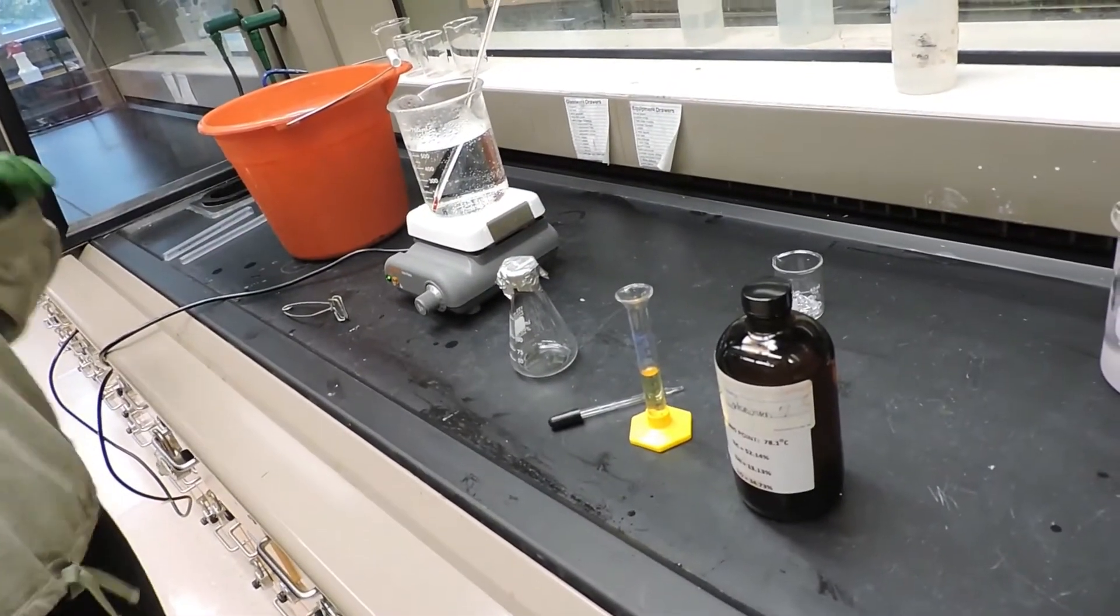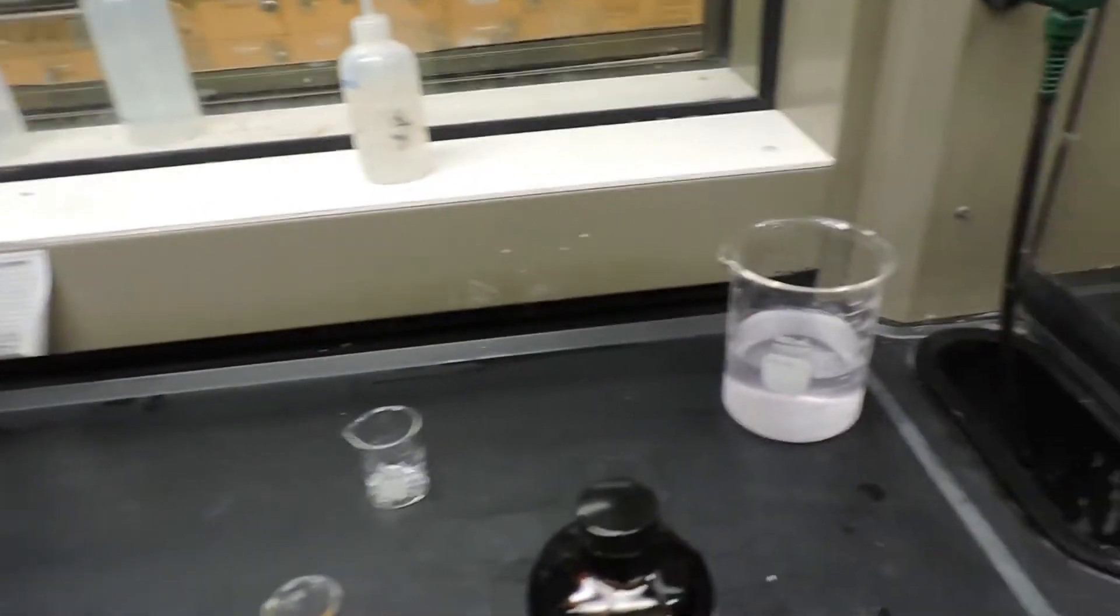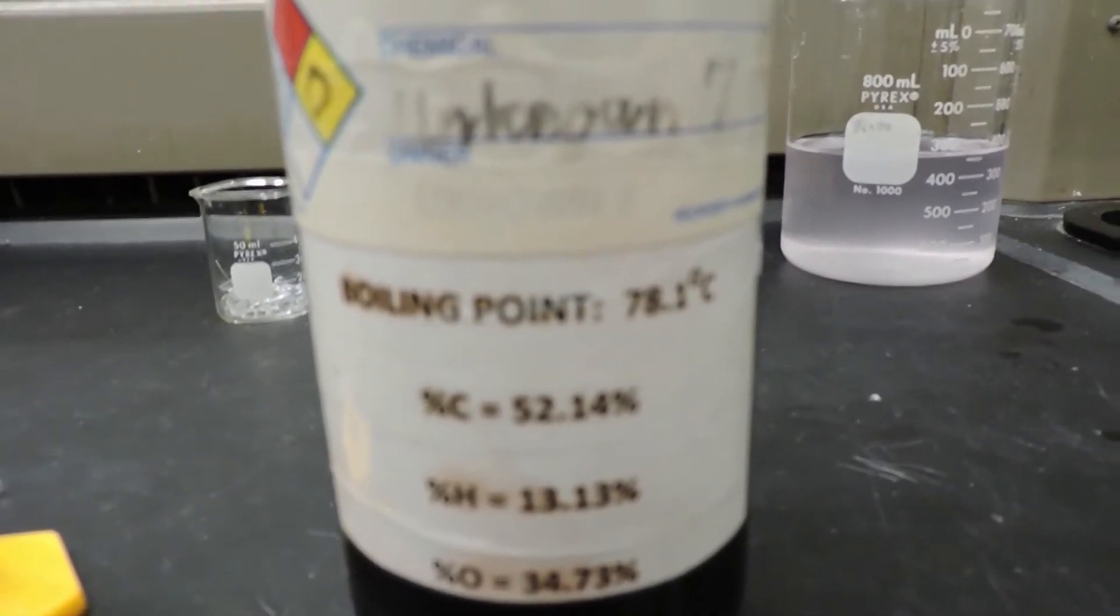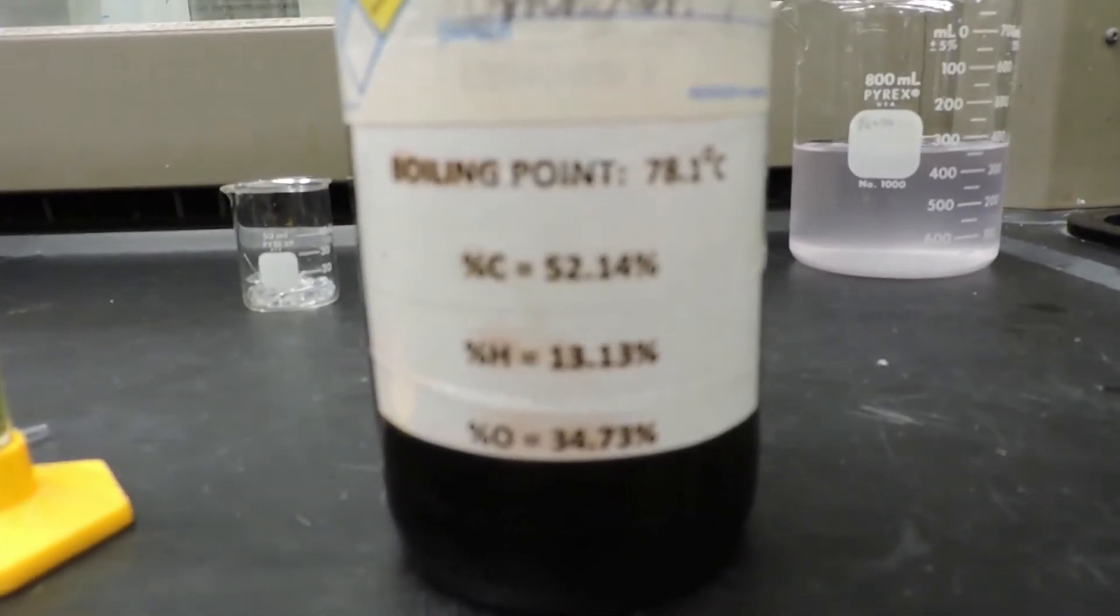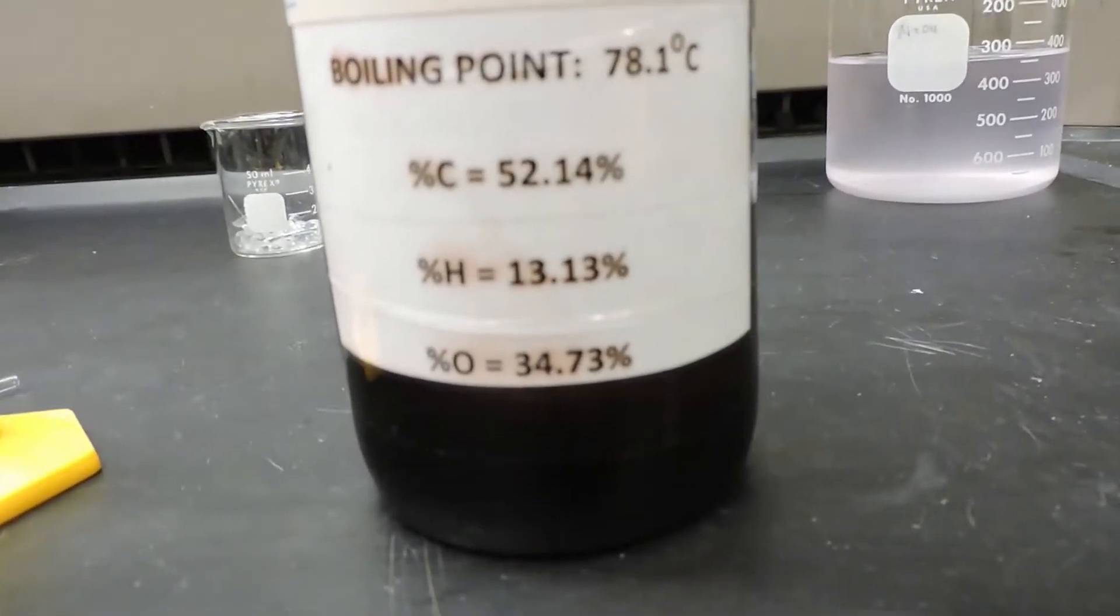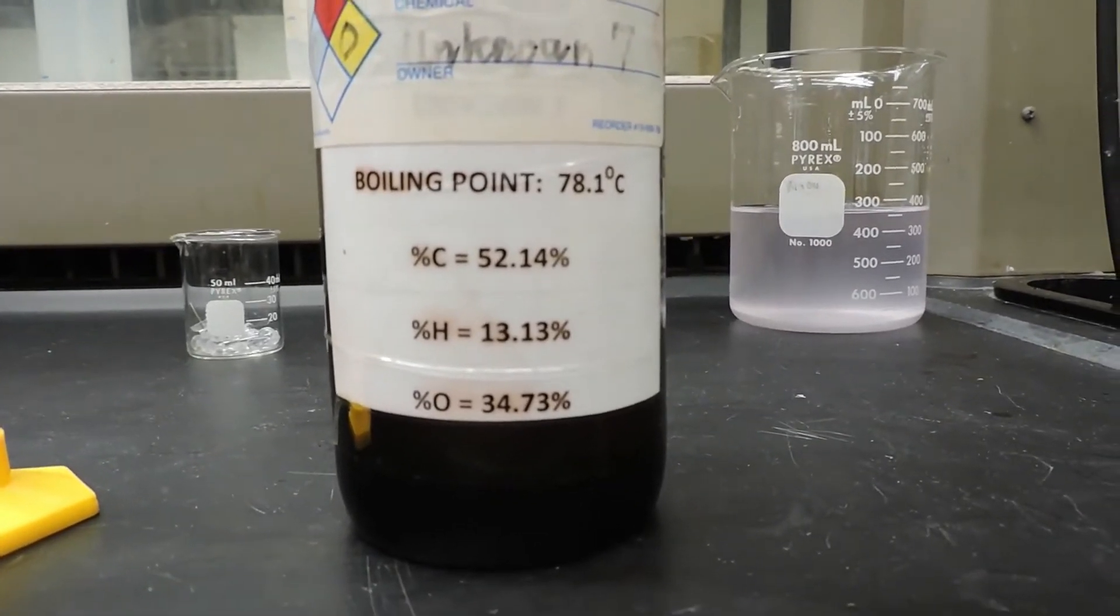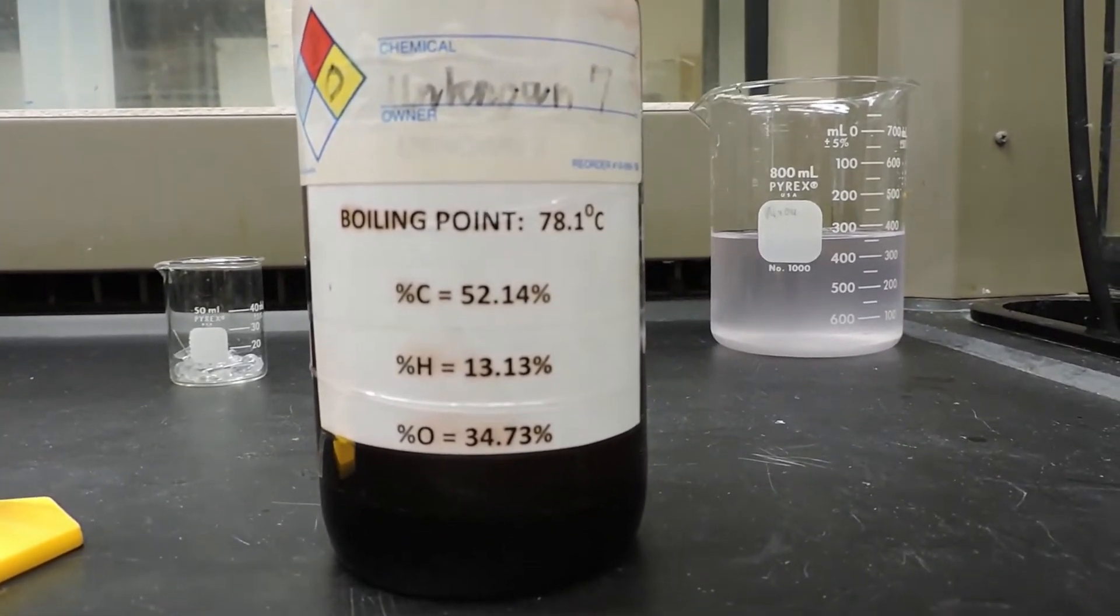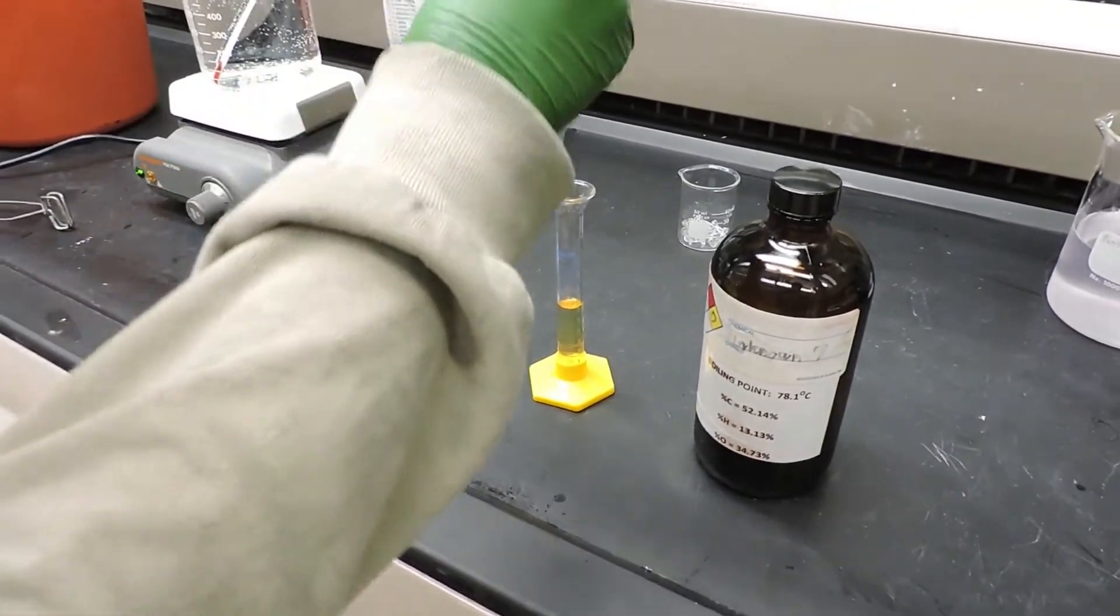With our heated water bath on a hot plate, we're going to use a 10 milliliter graduated cylinder to measure and pour out approximately 6 milliliters of our unknown liquid. The unknown liquid is unknown number 7 with a boiling point of 78.1 degrees Celsius and molecular components of 52.14% carbon, 13.13% hydrogen, and 34.73% oxygen. We'll take our unknown liquid and introduce it to our pre-weighed Erlenmeyer flask.